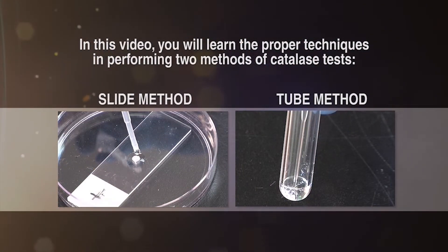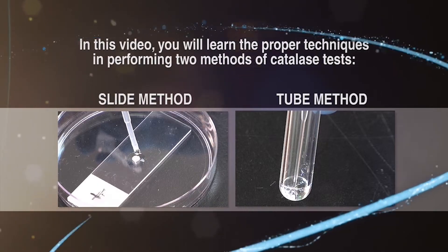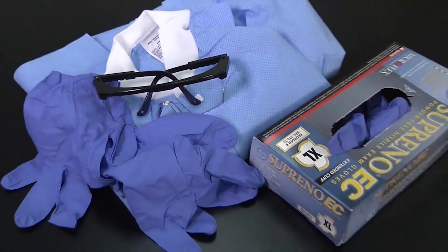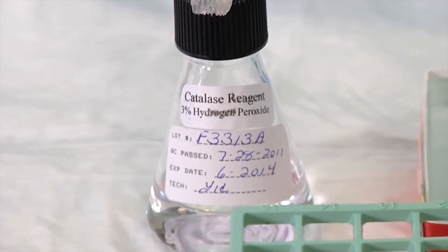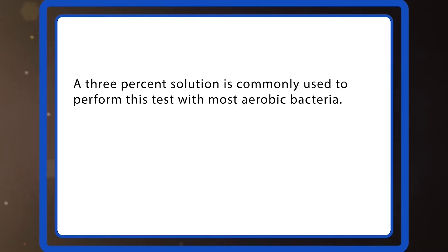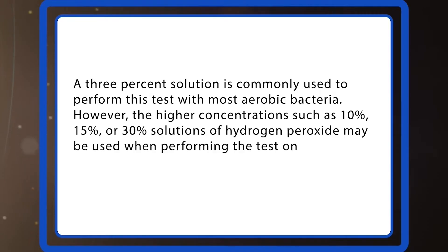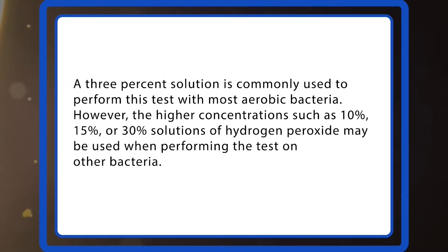In this training program you will learn the proper techniques in performing two methods of catalase tests: the slide method and the tube method. For these procedures you will need personal protective equipment and a three percent solution of hydrogen peroxide (H2O2). A three percent solution is commonly used with most aerobic bacteria; however, higher concentrations such as 10%, 15%, or 30% solutions may be used when performing the test on other bacteria.